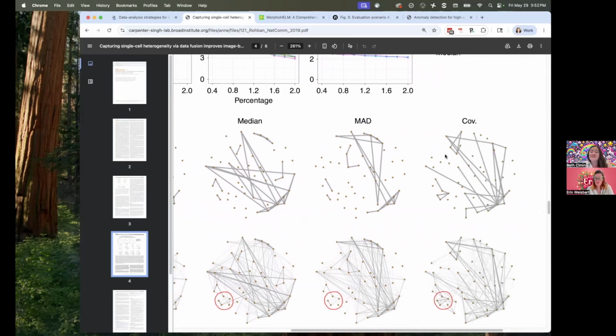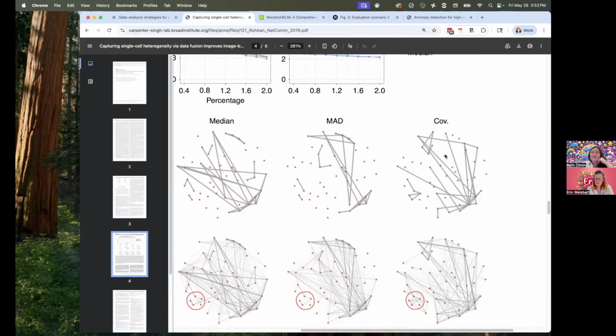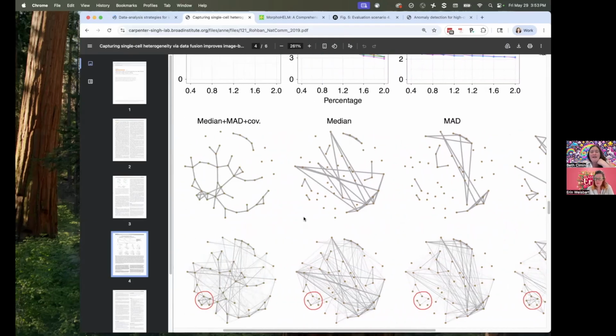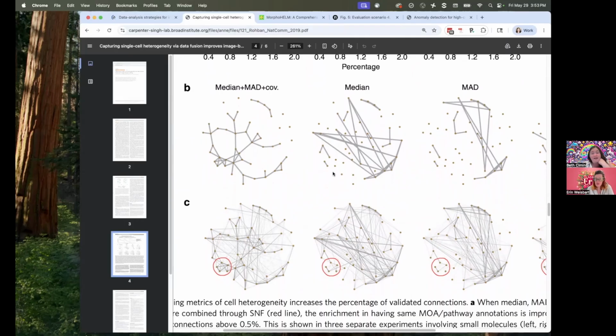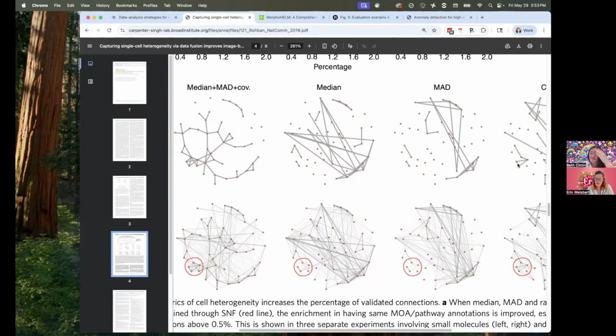in all of these different spaces, all of which will behave slightly differently. Then we use a technique called similarity network fusion, and what we look for are connections that persist across multiple interpretations of the data and different ways of shaping the data. So this connection here is probably a stronger connection than one you only see in some ways of looking at the data, but not others.